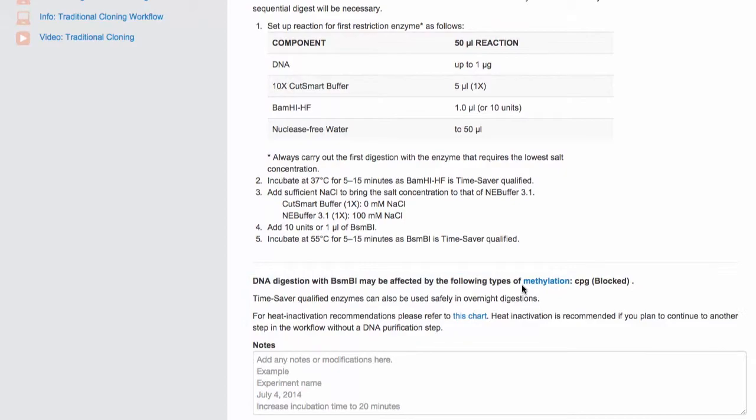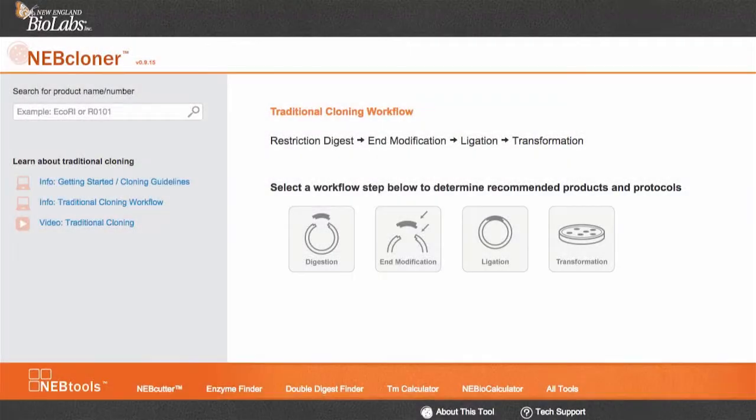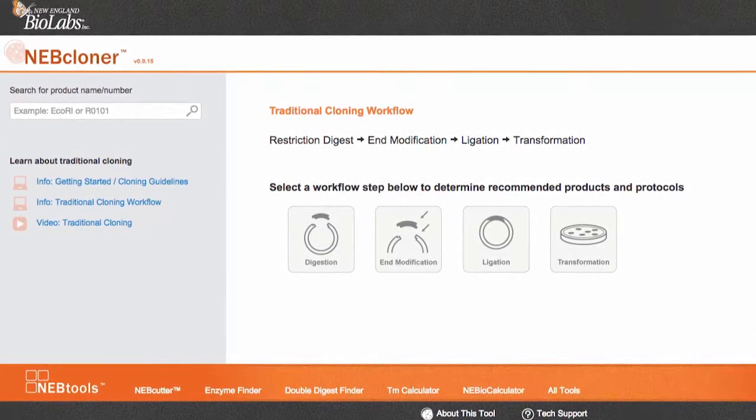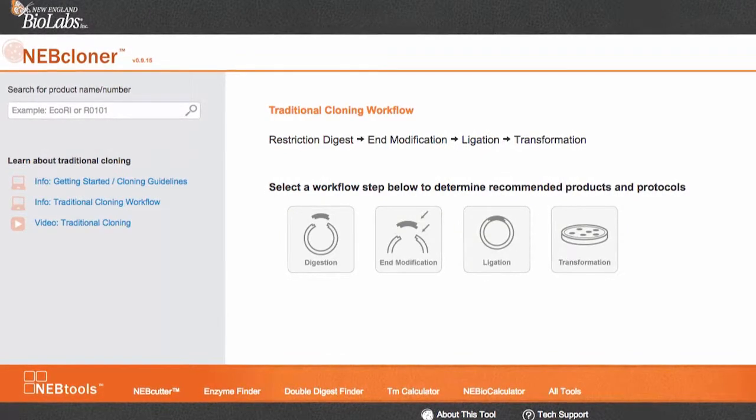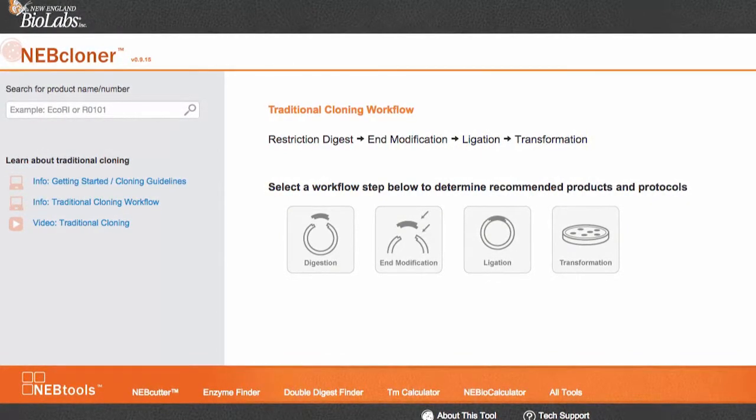It also links you to heat inactivation information. And that's it. Simple but comprehensive, use NEB Cloner to help you with your double digest. Thanks for joining us.